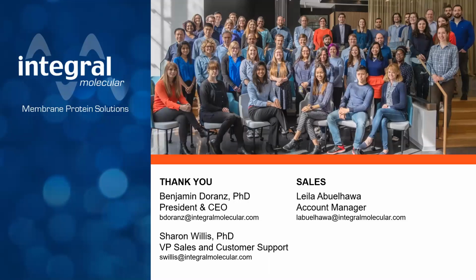Great, thank you. Can you say a little more detail on the cells that are being sent with the free kit? So, what's the background of the cells, that type of information? Yeah, so we've actually designed a number of cells. We've made a number of cells to date. So we've tried to optimize the cell type for infectivity to optimize people's assays using Vero cells, using A549s, and some other cell types. But the one that seems to work the best for us internally are HEK293 cells stably transfected with ACE2. So that's the one we'll be sending out.